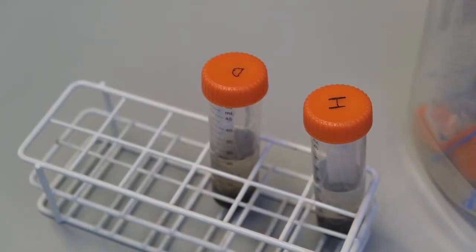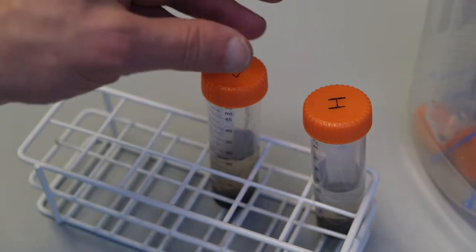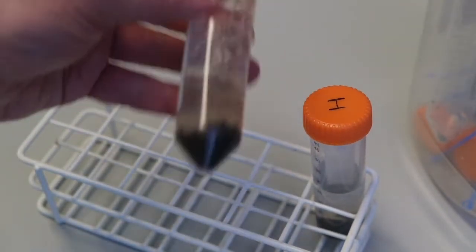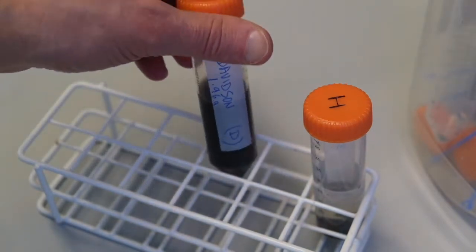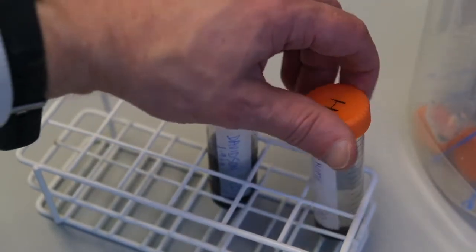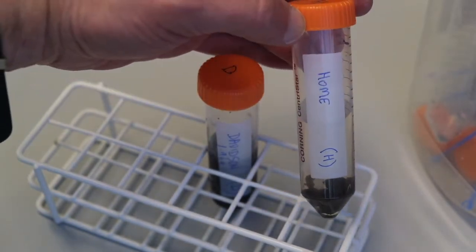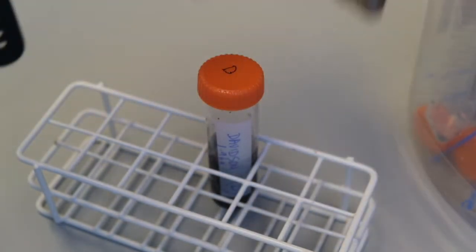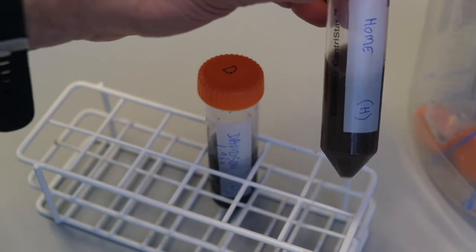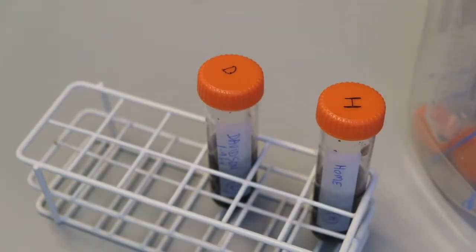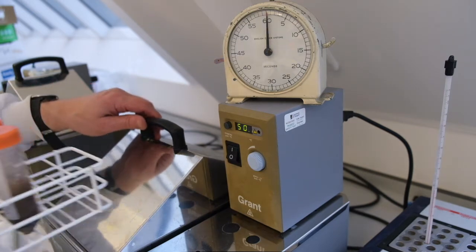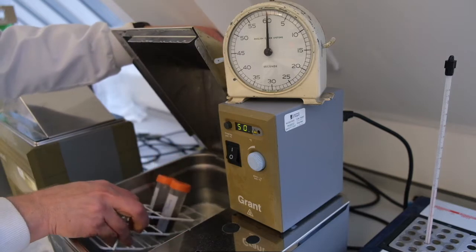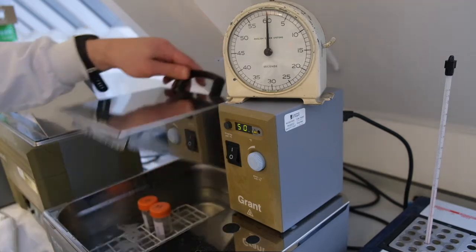Make sure the lids are on tightly and shake the tubes vigorously to break up and suspend the soil samples. Shake the samples again to make sure they are fully resuspended and then we place in a water bath at 50 degrees centigrade for one hour.